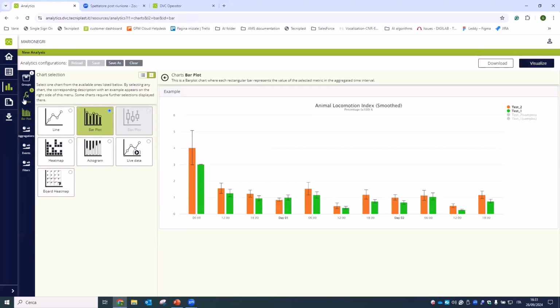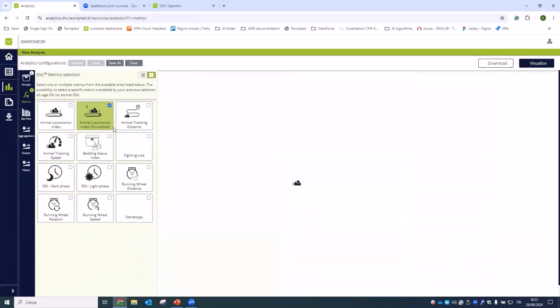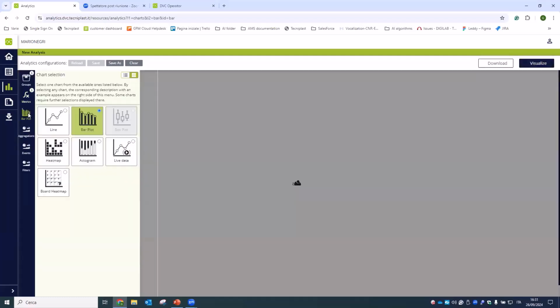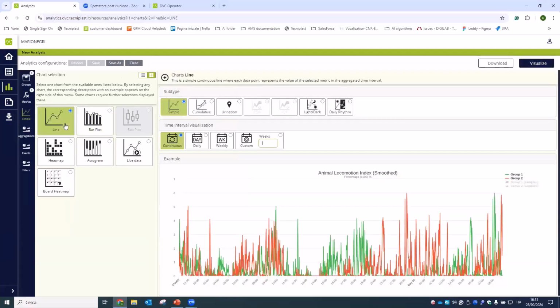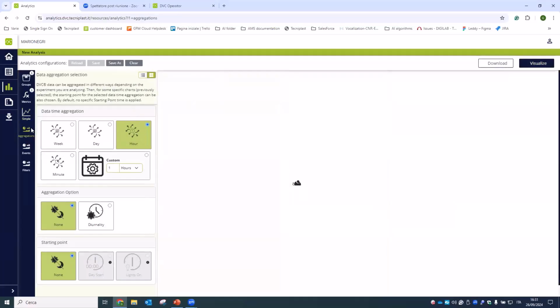I cannot select multiple metrics as before, I show you quickly. In the chart, you can only select one chart type, or at least one chart at a time. Let's stay simple, as said, line and continuous, and then we will go deeper into the others very quickly. And then, following, again, what is the aggregation period? By default, the hour. This really depends on you.